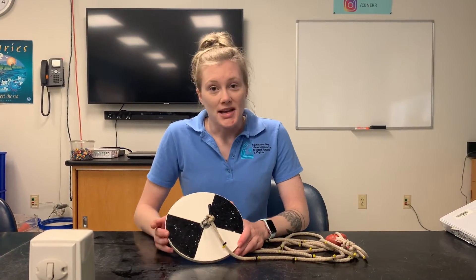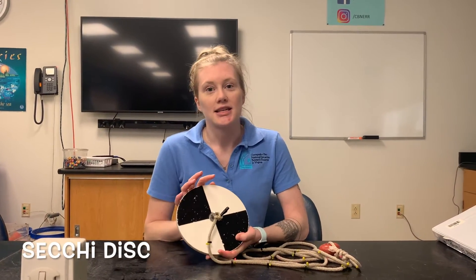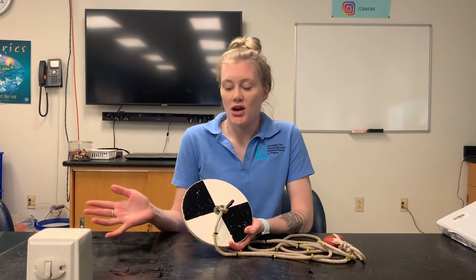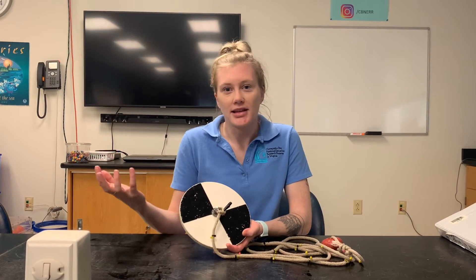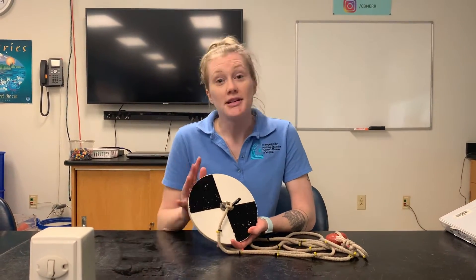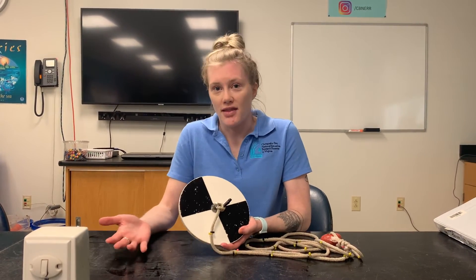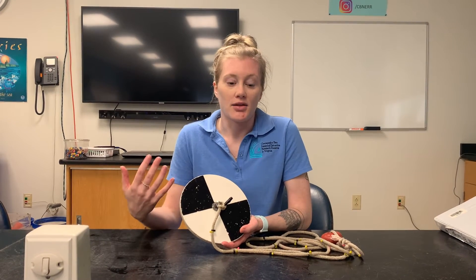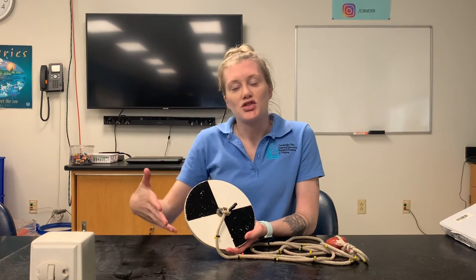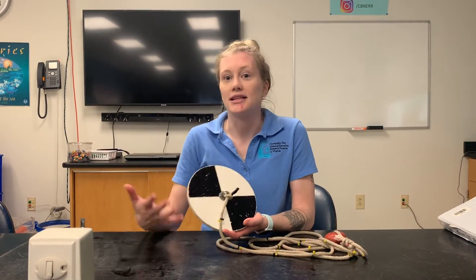Another piece of equipment we're going to talk about today is called a Secchi disc. The Secchi disc is used to check turbidity — that is, testing all the suspended matter in the water, basically how clear your water is. The reason we test this, especially here in the Chesapeake Bay, is because we have a lot of plant life at the bottom, including seagrasses. If sunlight can't penetrate down to those seagrasses, it can cause a lot of problems, so we want to have nice clear water.